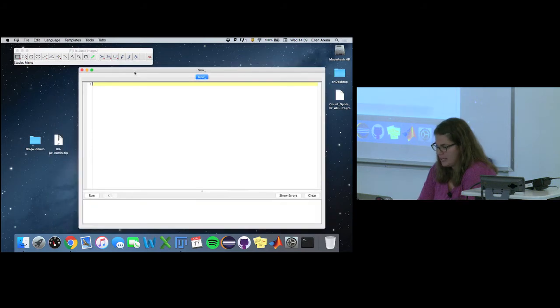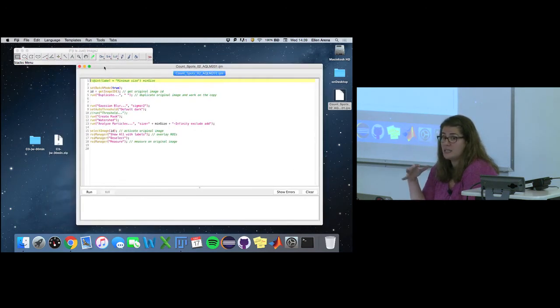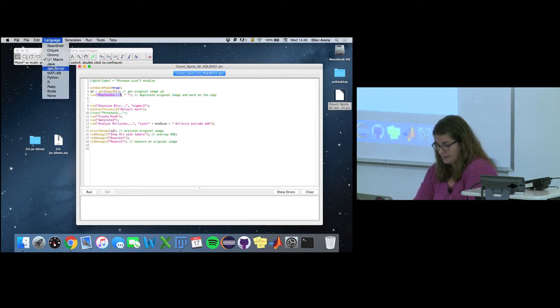Okay, so if I open an example code, you'll see that it's syntax highlighted again, right? I think I was kind of hinting at that. The green color indicates comments, so they're not technically read in by the system, except in the case of script parameters. Those are a very weird exception, which we will go over in more detail later on. Functions are this yellow color. Strings are in this magenta. Numbers are in blue, I think, in the end. Again, if you don't see that colorization, you need to make sure you activate a language here. Okay?